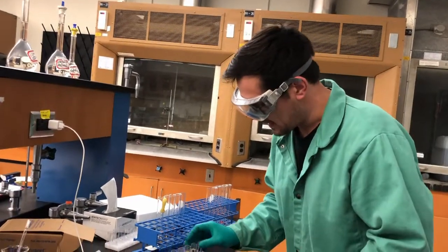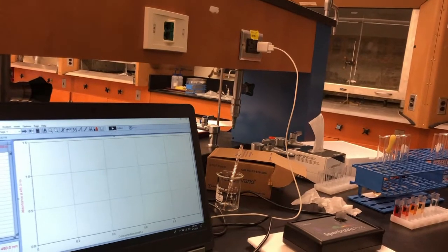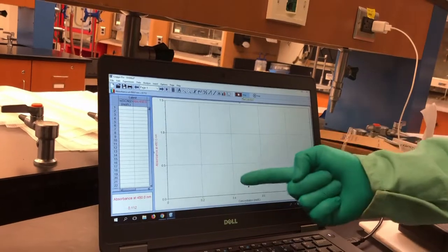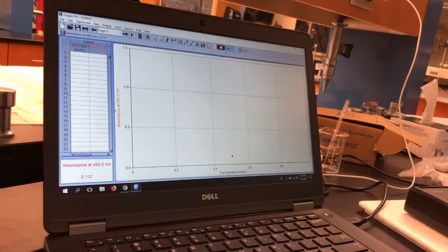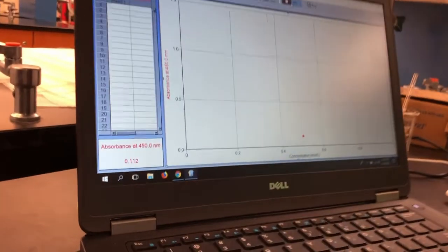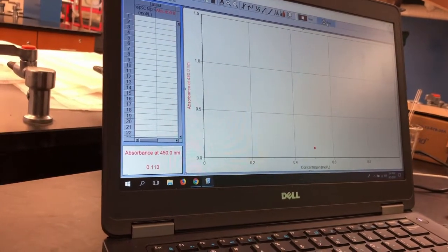Once we start adding, starting with our most dilute concentration, we will notice our absorbance start increasing. So I'm going to push collect, and what you'll see is a point come up on your graph, and it's recording the absorbance for that concentration of iron nitrate. So again, this is reading the absorbance of the iron thiocyanate complex that is formed. What I'm going to do is push keep.